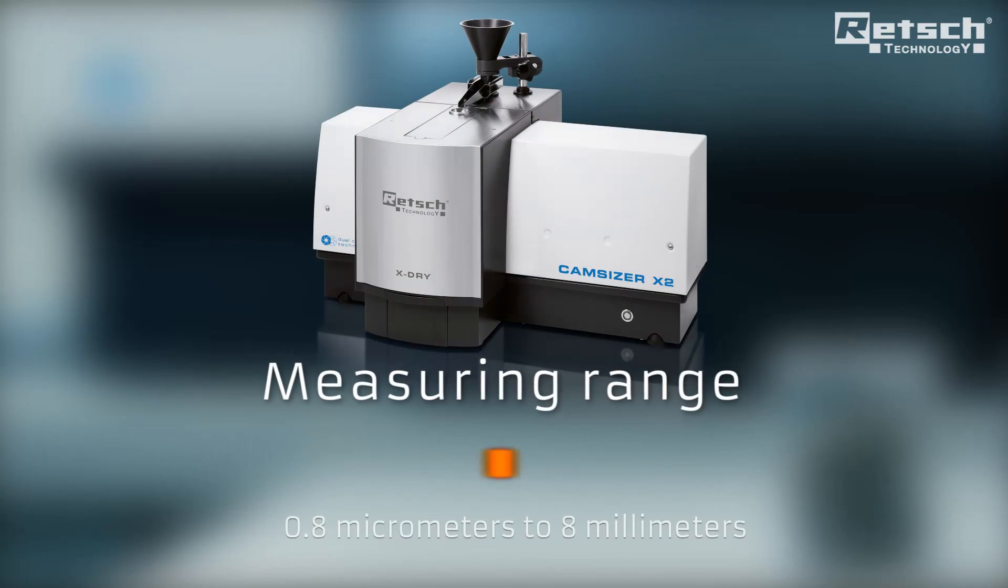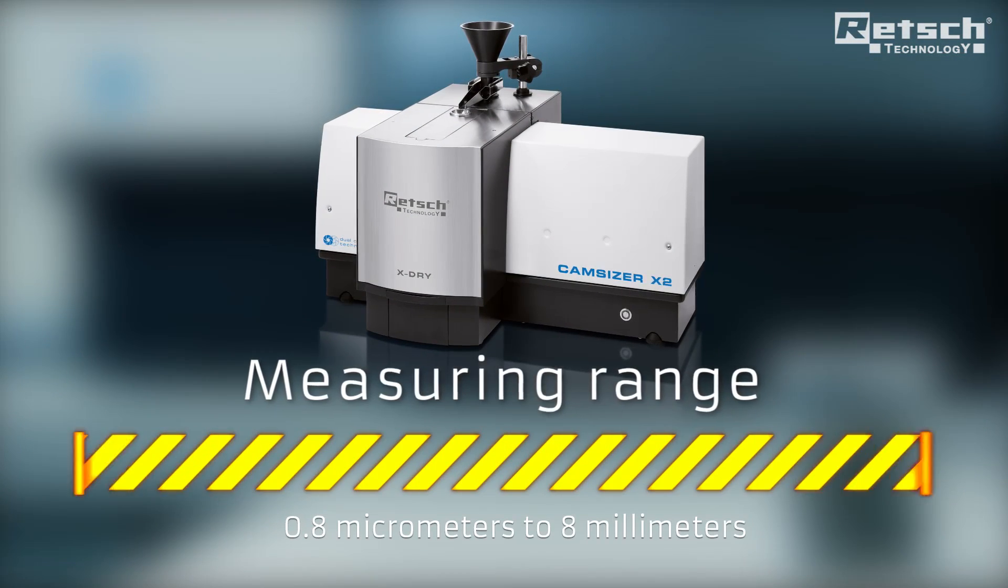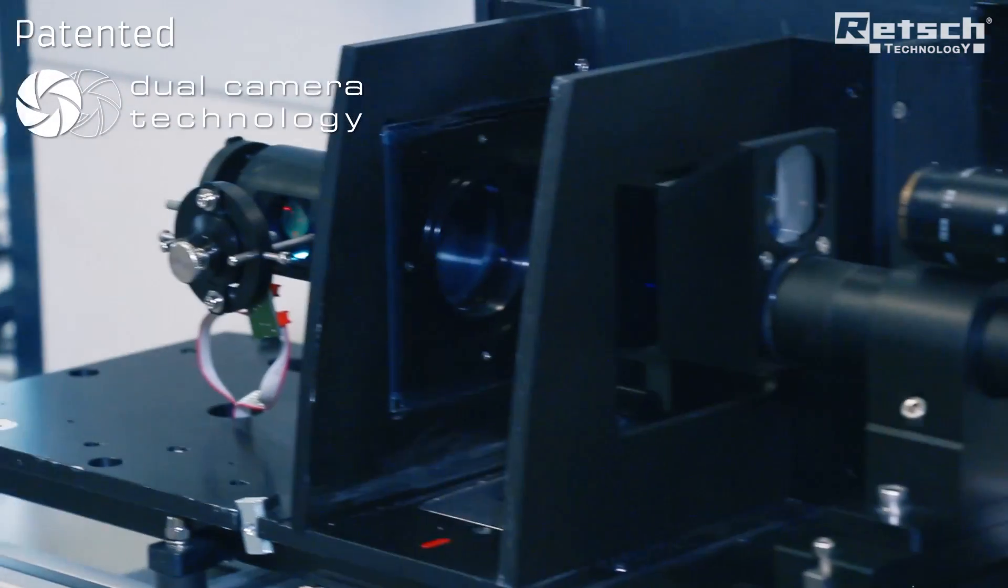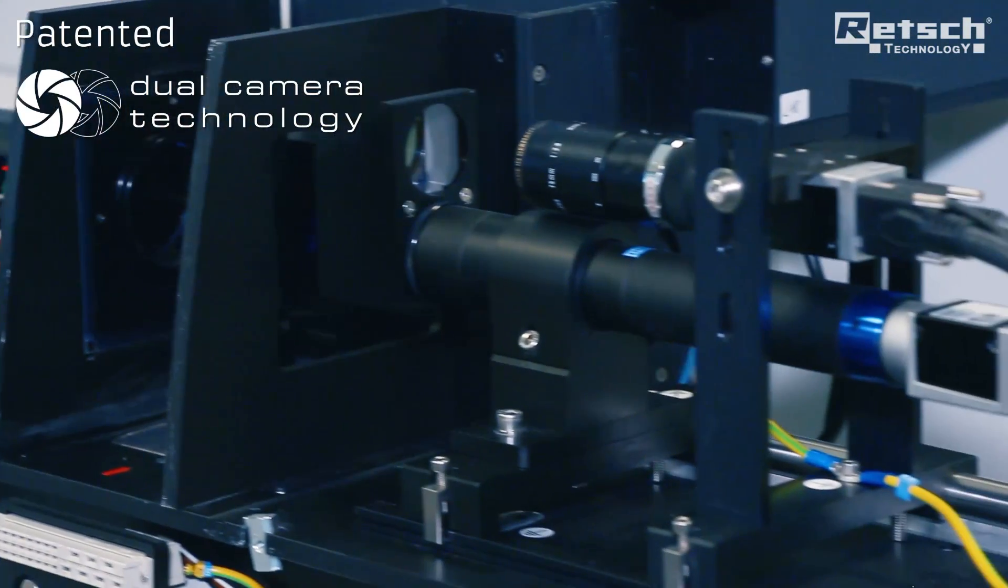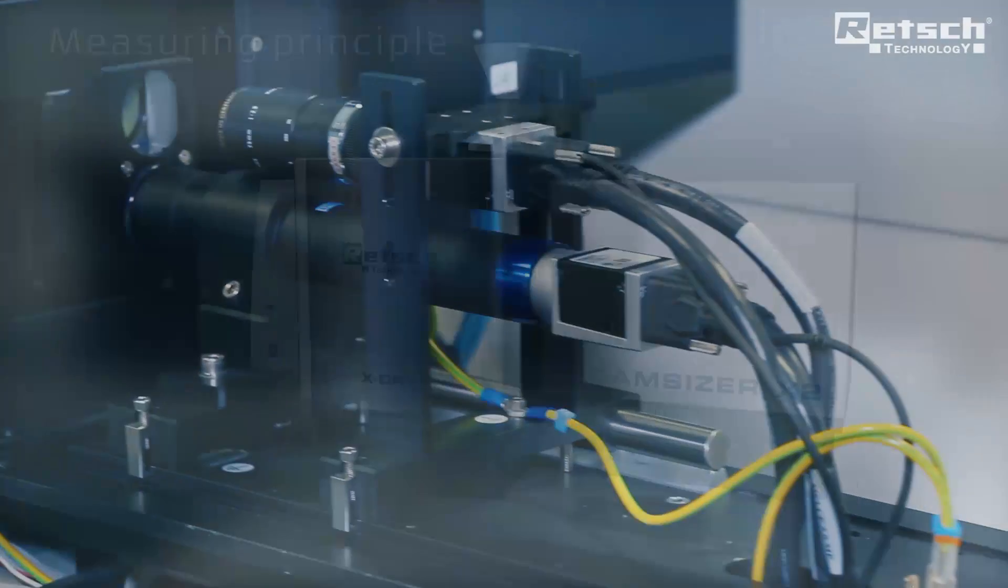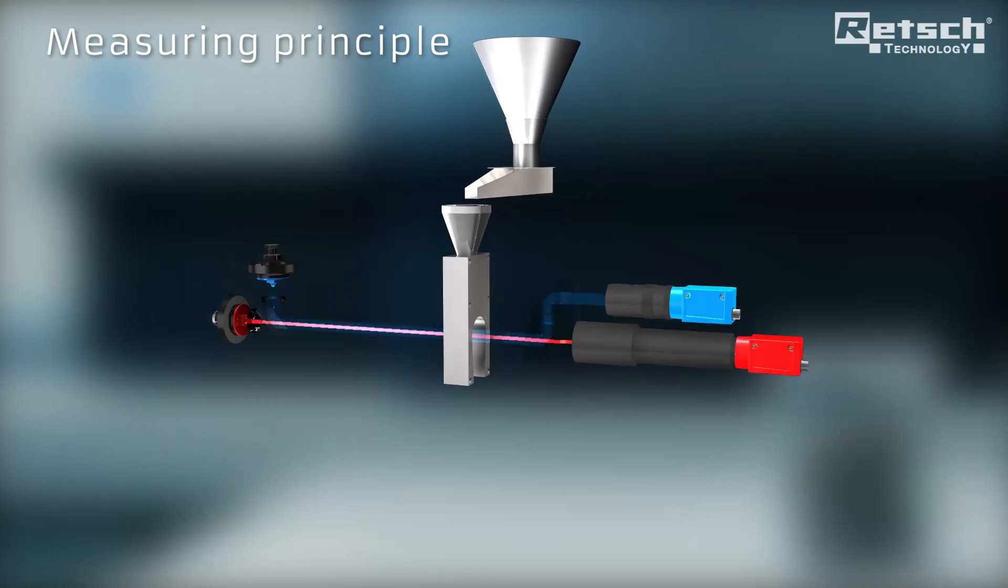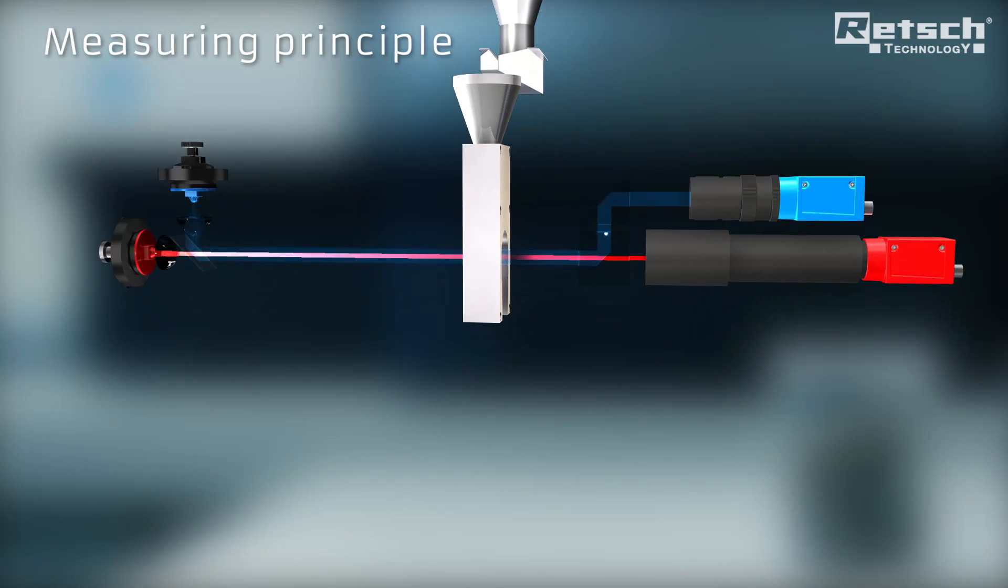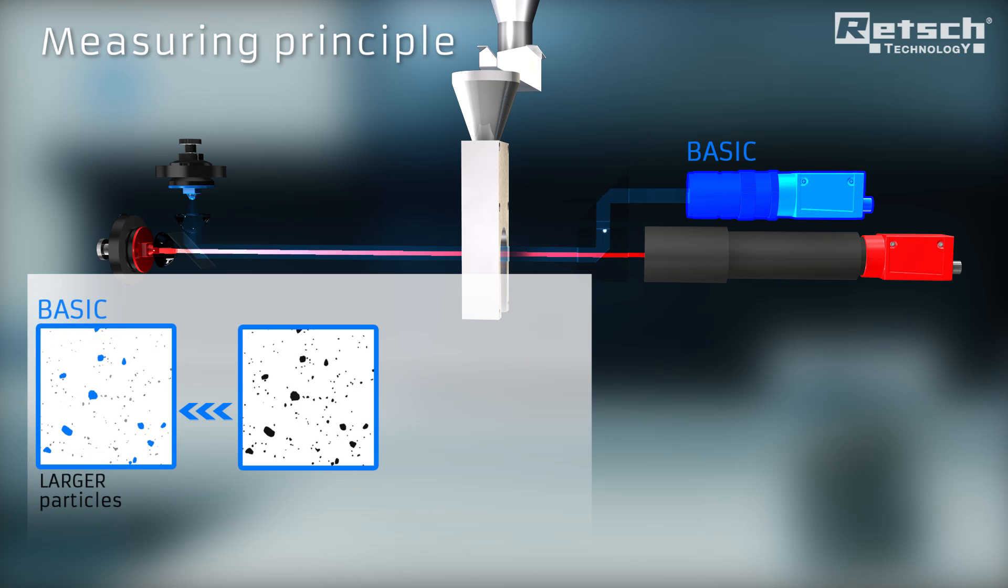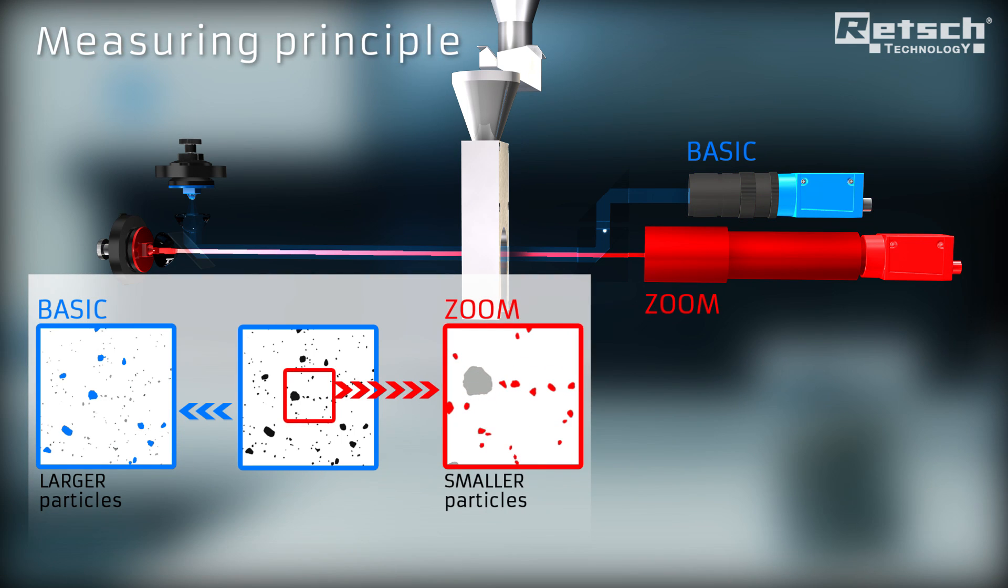The CamSizer X2 covers an extremely wide size range in only one measurement run. This is made possible by the patented dual camera technology, where a basic camera detects larger particles, whereas a specially designed high-resolution zoom camera analyzes particles with high accuracy.